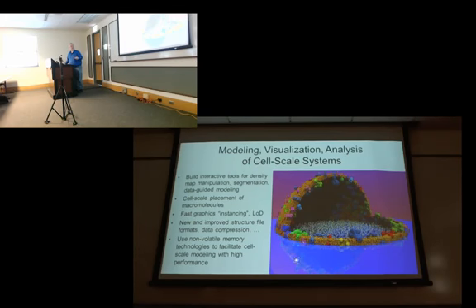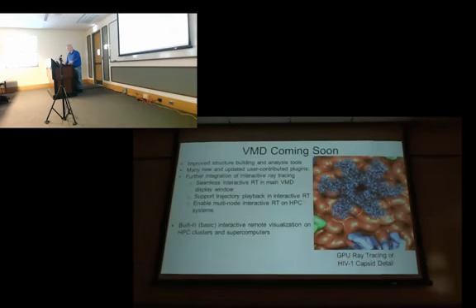You can have mirror reflections, so you can see the reflection off the surface of this solvent here that they cut away. Some of the things we're working on going forward then are supporting interactive visualization in VR head-mounted displays.